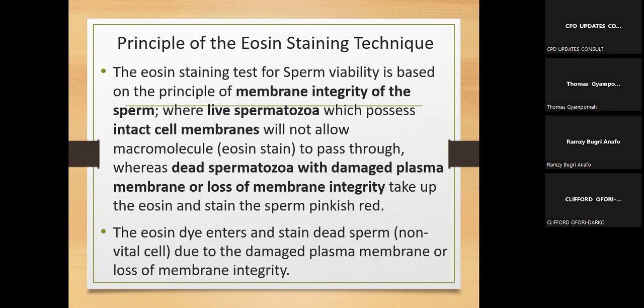That's why we are saying that even though this is supposed to be a supravital staining, the stain being used is not a vital stain, because it cannot penetrate a living cell. What it can do is penetrate those that are already dead. So eosin is staining the cell not because it is living, but because it's not living. Therefore, those that are dead will pick up the stain.